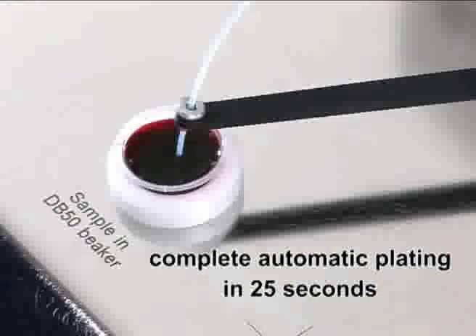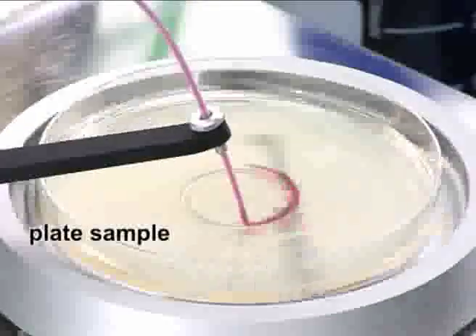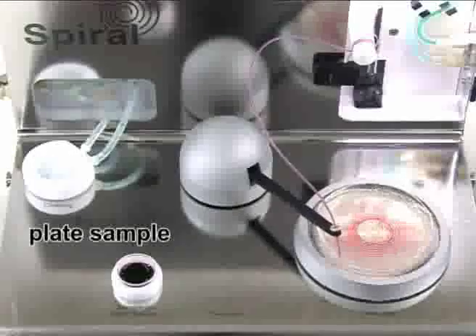The EZ Spiral takes the spiral method to a new level of efficiency. With the EZ Spiral, only 25 seconds are necessary for a complete cycle.